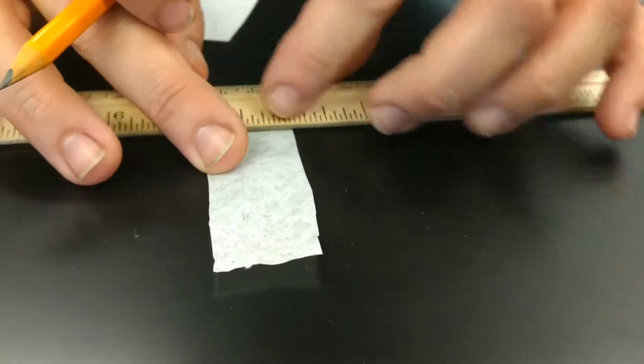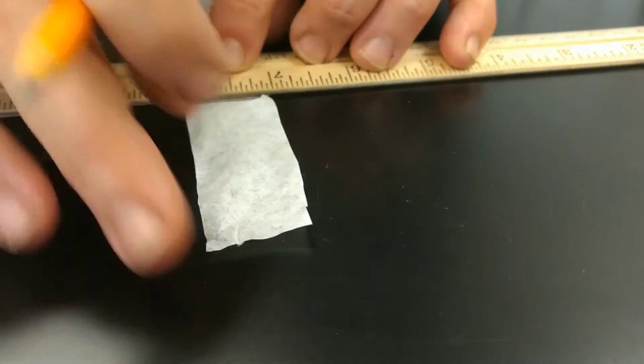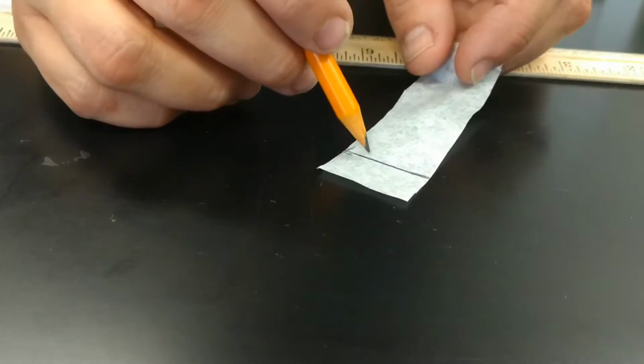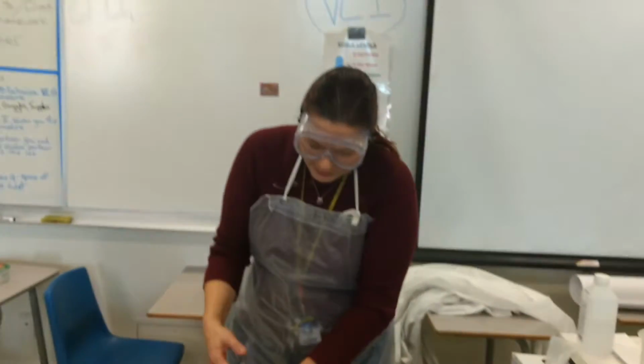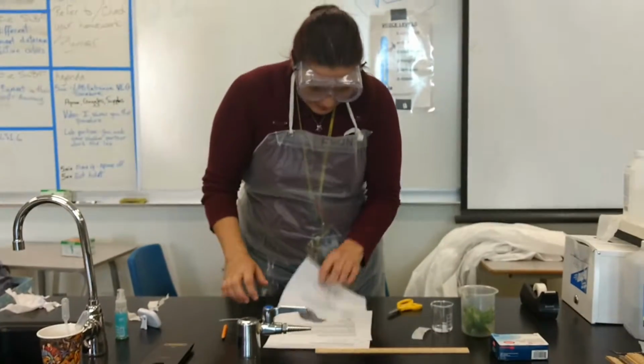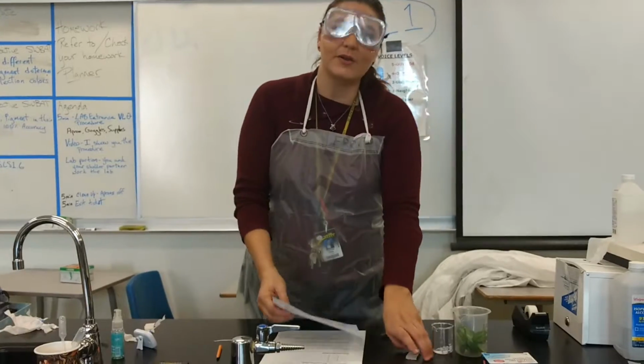and this paper is very flimsy, so be very careful with it. It tears easily. I don't have very much of it, so please make sure that we are careful. Now that is a firm line. Very good. Now, what you're going to do is make the check mark. I did that. Okay. Baseline. Do not use pen. It says do not use pen in bold. So what are you not going to use?